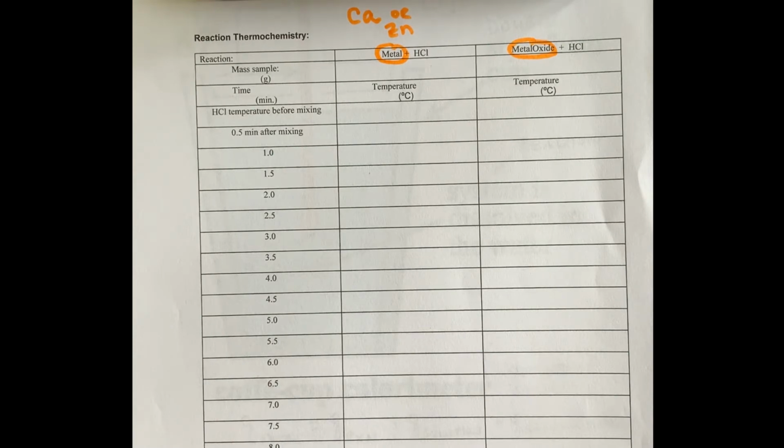Let's go to our presentation again, and then we'll come back here and do a sample set of calculations. All right, so as you can see, you're going to be provided with a data sheet that has values of temperatures read as the reaction progresses. So let's go here to our screen and see how we're going to handle this.